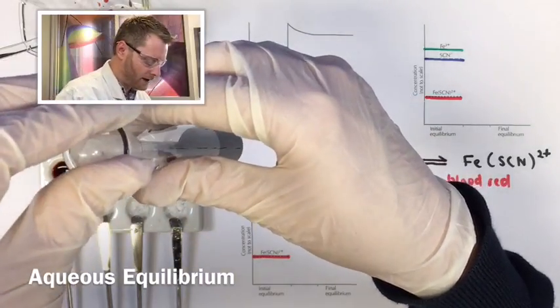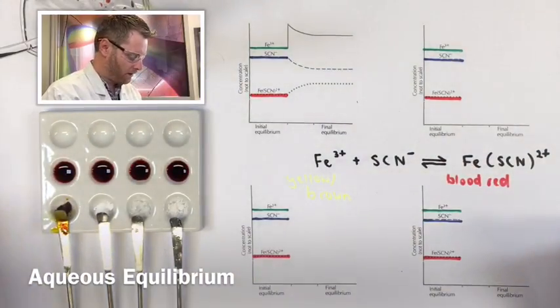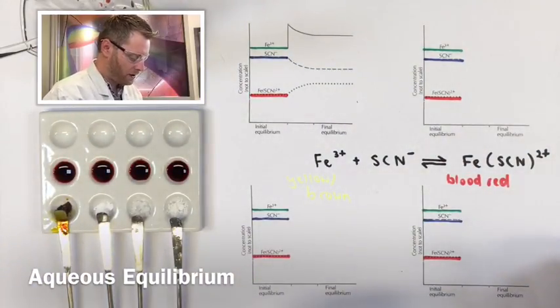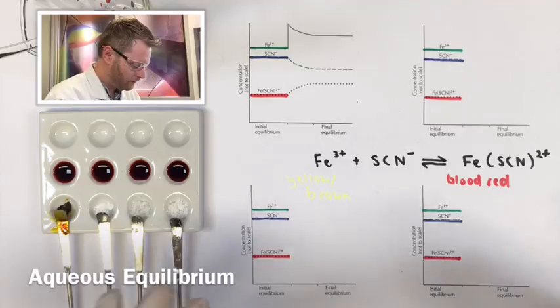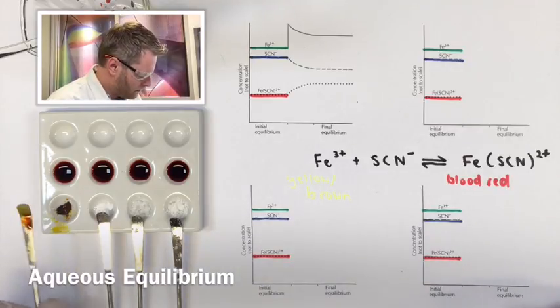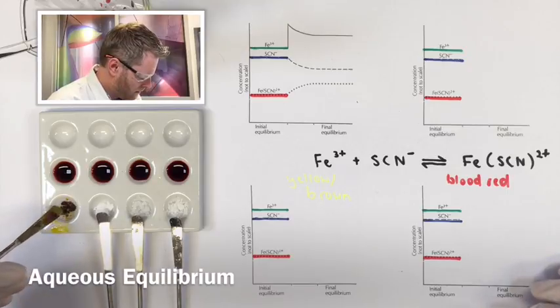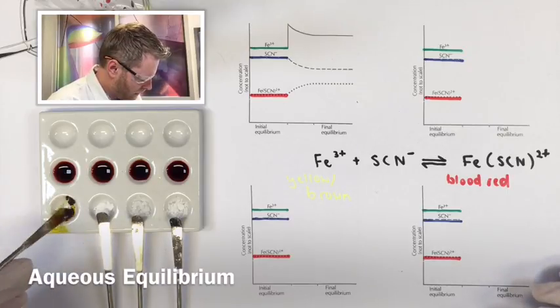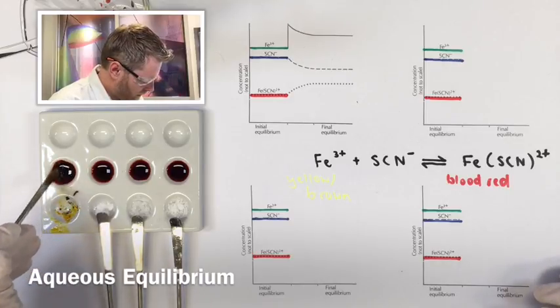Okay, what we're going to do today is see if we can shift this equilibrium system in the forward and the reverse direction by changing some of the concentrations of the ions that are present. So in the first one, we're going to add some ferric chloride, some iron chloride. Give that a bit of a stir.